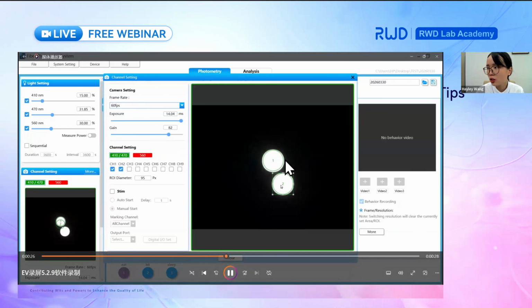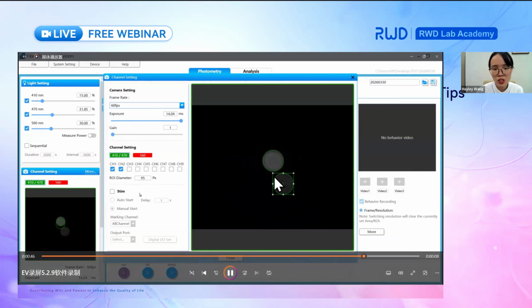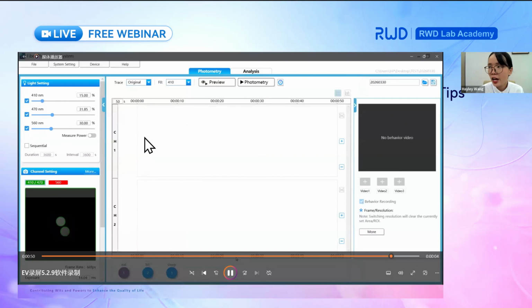After that, we gently move the fiber end toward the light source and increase the gain, and we check the end. Next, we select some channels from channel 1 to channel 9, and we also adjust the ROI so that it stays within the fiber end. Finally, we reduce the gain back to 1 and save the settings.